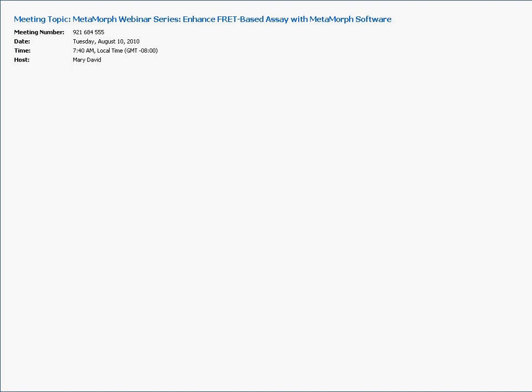Songhai asks, again, do you need to do background correction for both corrected FRET and YFP images before calculating the ratio, and how do you export the images with the scale bar? Is this a scale bar as far as intensity, or as far as size? Those are two different. She does not specify. Okay.